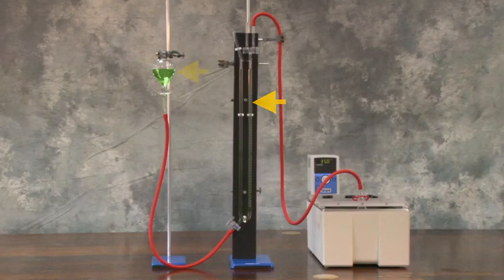So in order to release that pressure and get back to atmospheric pressure, we have this extra reservoir of liquid here. This reservoir can be lifted up or down so that the level is maintained at the same level as where we're making our reading. In that case, all the levels will be equal. We'll have atmospheric pressure inside the volume, and we'll get a correct reading of the gas being evolved.